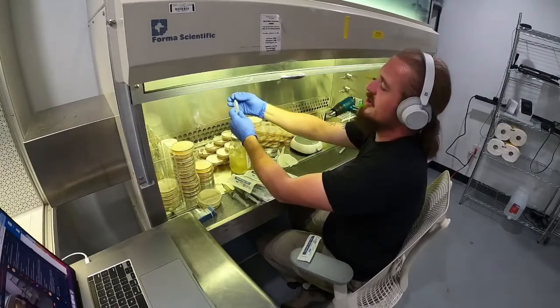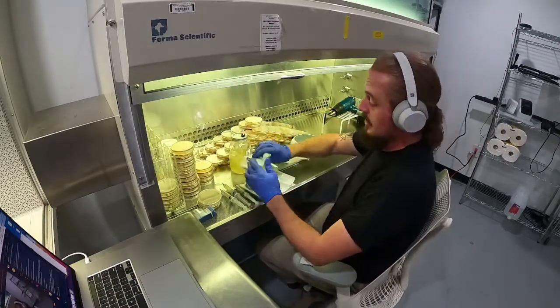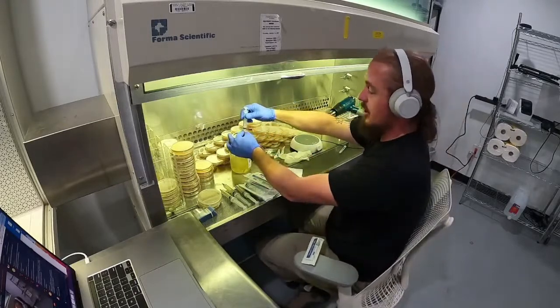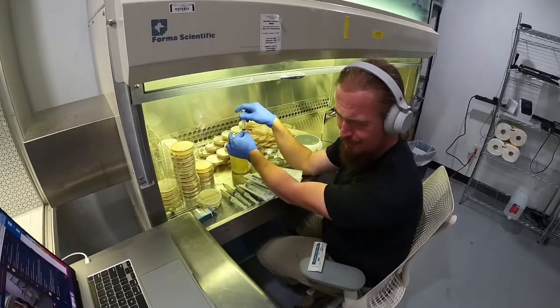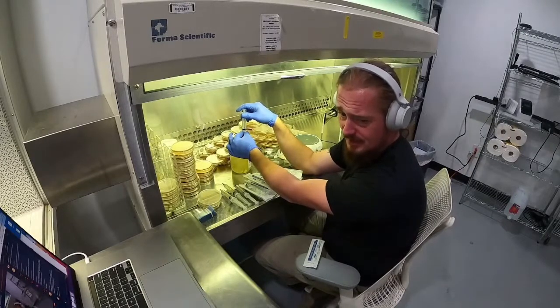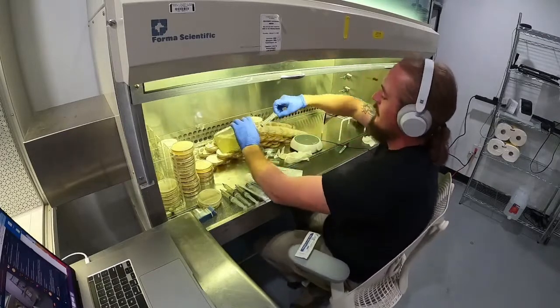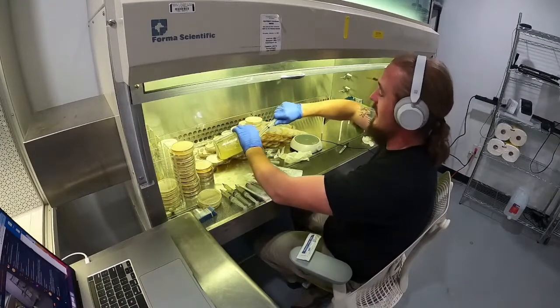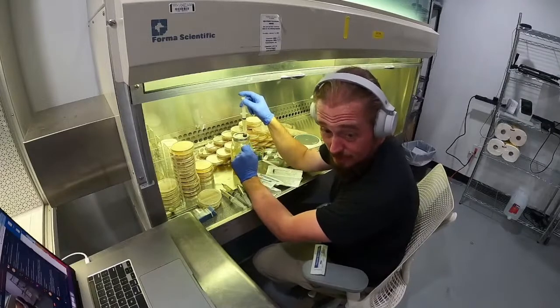Yeah, when I first started off, I bought everything, like cheap knockoffs on Amazon. And I couldn't figure out why everything kept sucking wind, because I'm looking at other commercial mushroom farms and they're like, we have a contamination rate of 20%. And that's really low. And I'm like, I'm an engineer. 20% variance on anything is bad. I mean, screw that. But I start off buying all this cheap stuff off of Amazon and I had like a 60-70% contamination rate. And I'm like, well, maybe 20% is really good.